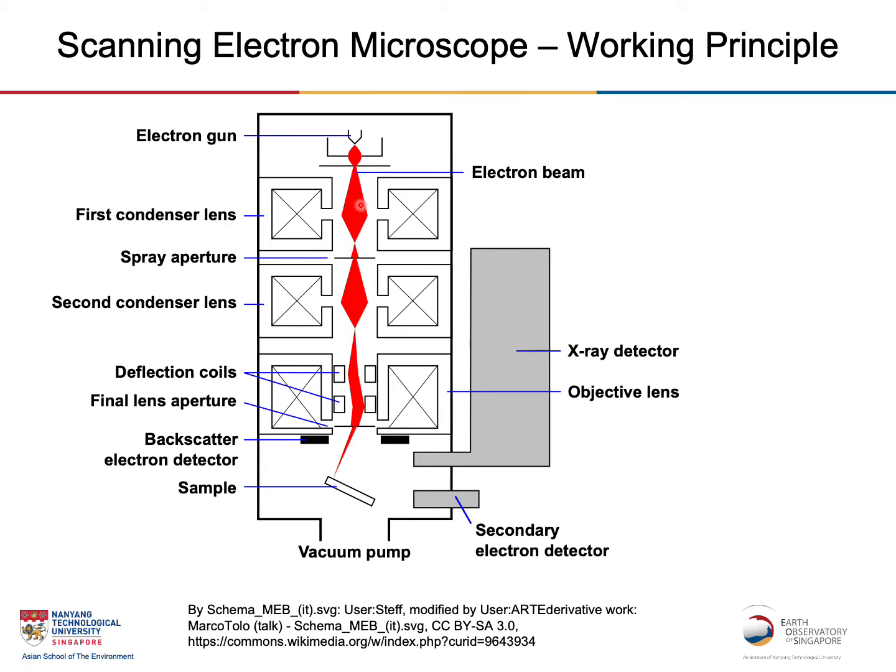When it goes down, the electrons may not have the same energy, and this magnetic lens spreads them apart, then converges them back and spreads them back again to filter away the unwanted electrons with certain unwanted energy. And then after that it is conditioned again.